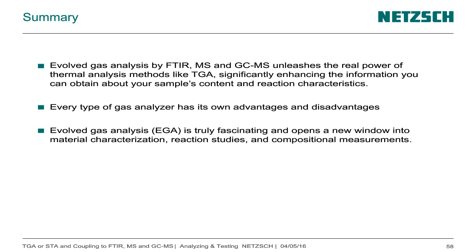With MS, no problem. If you have some dirt and the dirt stays in the capillary, you can cut the capillary. With FTIR, if you have some dirt in your transfer path, it's easy to clean everything. With the GCMS and the column, you have dirt if you take a lot of sample, and some samples really produce high boiling things, which condense on your transfer path.